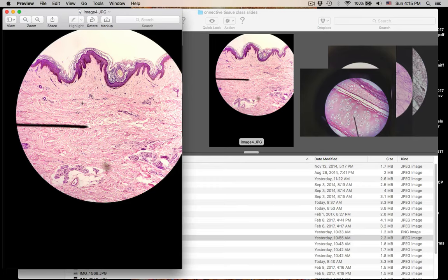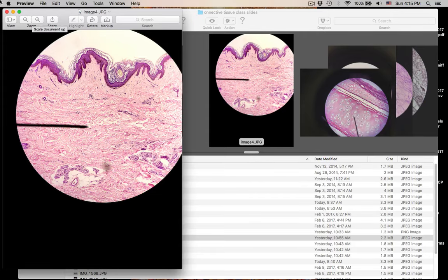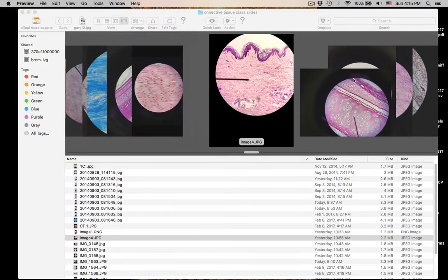This is dense irregular. This is skin again — remember this is the epidermis; epidermis is stratified squamous keratinized. This whole thing is the dermis. And so this is dense irregular in the dermis of the skin. That was number thirteen.